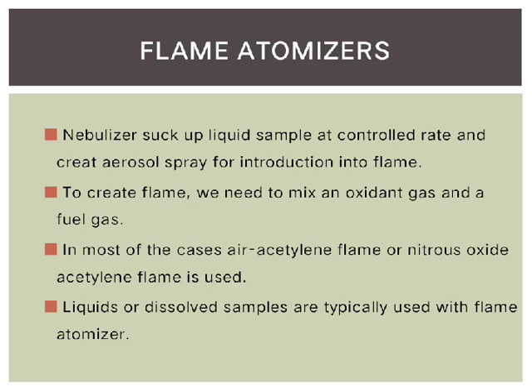Then flame atomizers. Nebulizers suck up liquid sample at a controlled rate and create an aerosol spray for introduction into the flame. To create a flame, we need to mix an oxidant gas and a fuel gas. In most cases, an air acetylene flame or nitrous oxide acetylene flame is used. Liquids or dissolved samples are typically used with a flame atomizer.